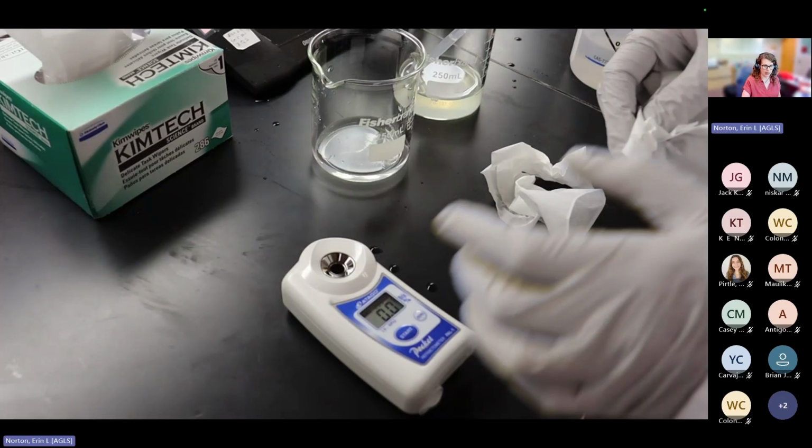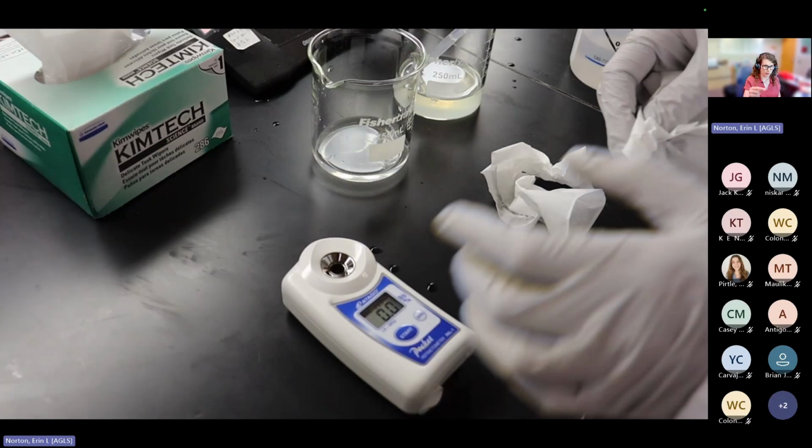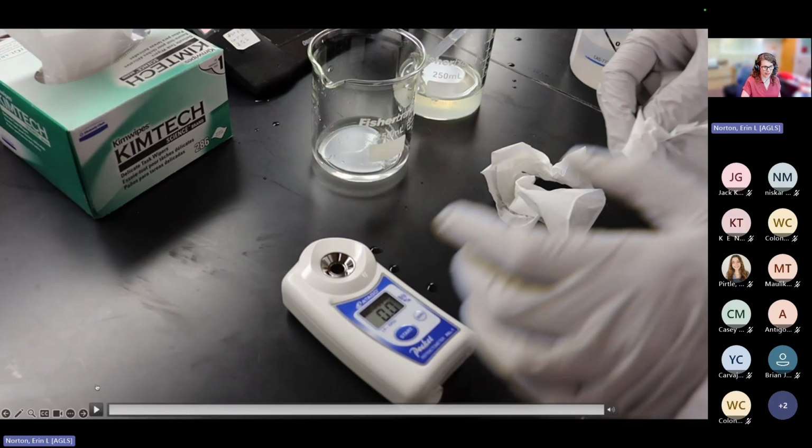You can see that we dried it and we're ready to go on to the next sample. You just drop a couple of drops onto the lens, hit start, and it reads the sample. And when in doubt, these are really quick, easy analyses to repeat. If there's any doubt in your answer and you think, oh gosh, that is way too low for what my brix should be, check it again. There's no harm in putting a couple drops on there and checking again.